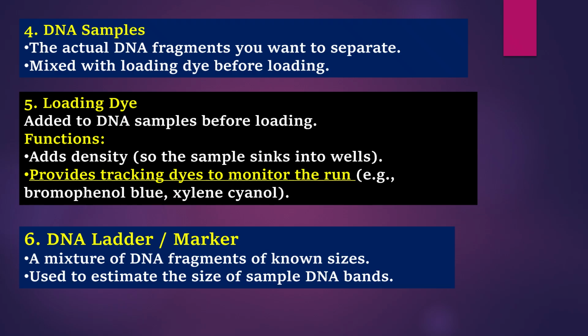Okay. Now, the fourth component is the DNA sample. First, we isolate the DNA using a standard protocol, and then it is mixed with the loading dye, bromophenol blue, and loaded. Now, what is the loading dye? The function of the loading dye is to add density to the sample, as DNA is not that dense, so the sample can sink and fit into the well properly. Generally it is bromophenol blue or xylene cyanol.